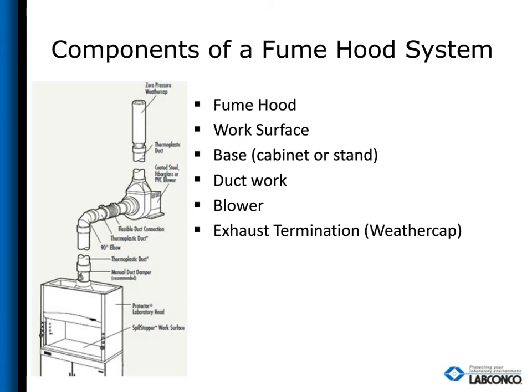So if you're looking at purchasing a fume hood, look at where the blower is going to be located and specify. And keep in mind that built-in blowers are not a one-size-fits-all solution. Blowers have to be sized for the duct run, and therefore you always want to verify the blower is appropriate for your duct run before you purchase it.